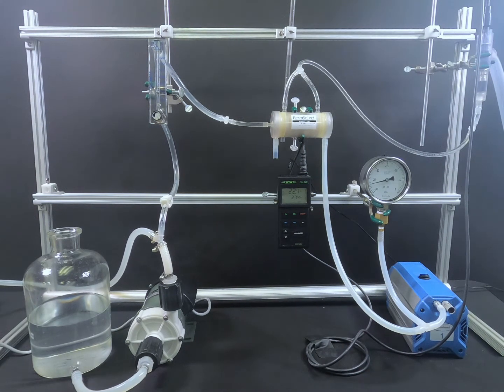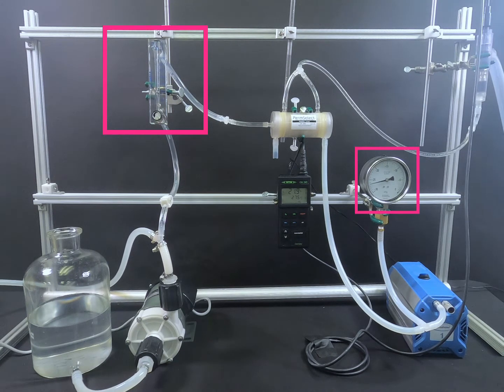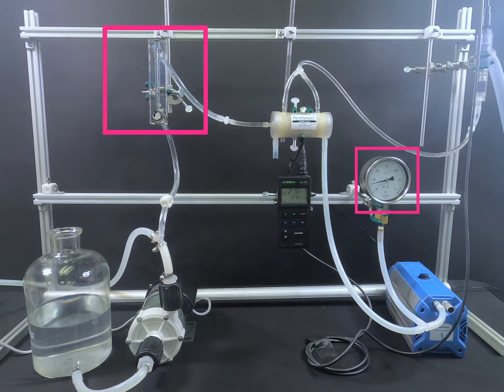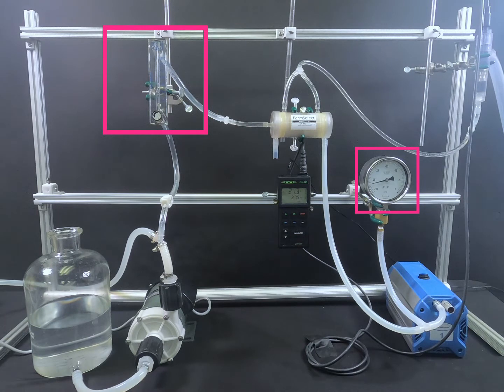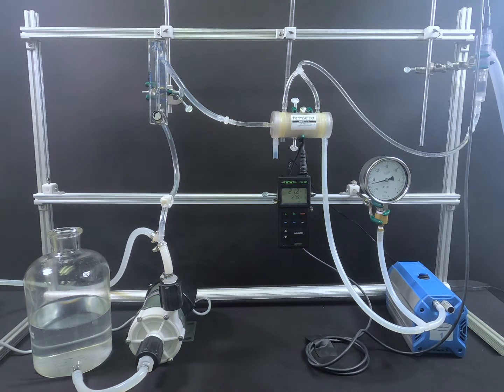The flow rate is 1 liter per minute and the vacuum measures approximately 27 inches of mercury. A lower flow rate and a higher vacuum will produce a lower oxygen percentage for the degassing application.